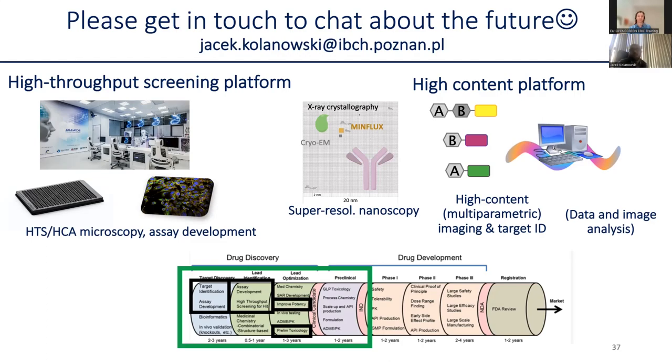For bioluminescence, they shouldn't be there, or less so. But for bioluminescence, you still need to feed plants with the substrate for the luciferase, which you artificially introduce. And penetrability, of course, will be a challenge as well, as will distribution inside the plants. Exactly. Thanks, Jacek, for this reply.